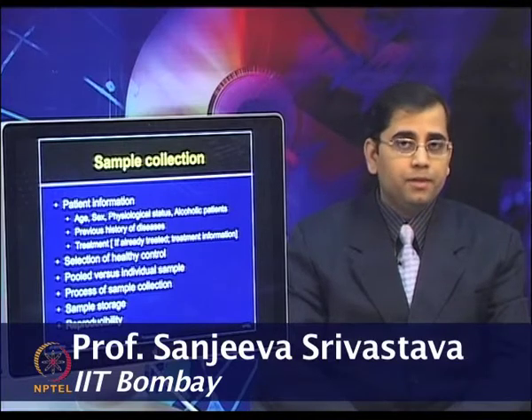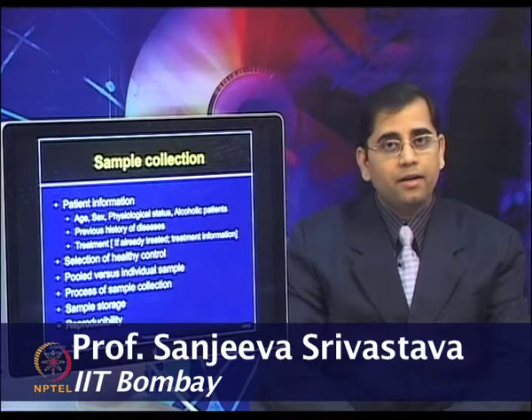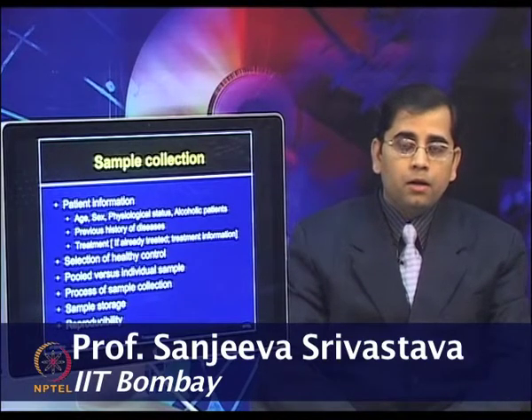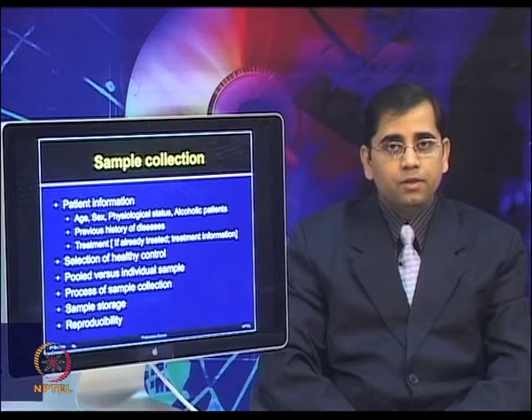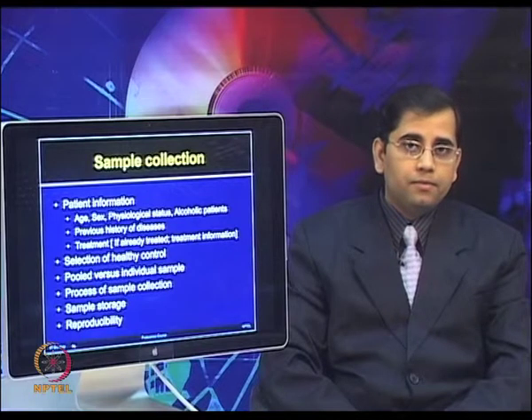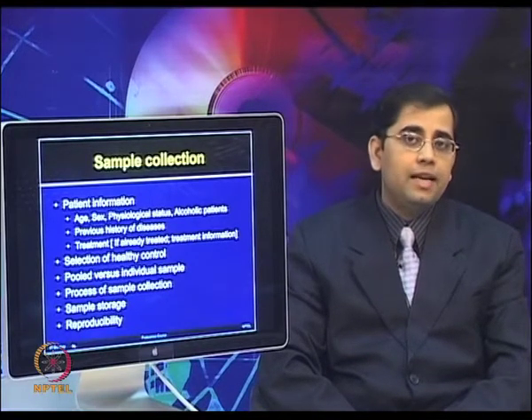Okay, after watching this animation, now you must be clear of the various steps which are required to perform this experiment. In clinical studies, first of all, obtaining the clinical samples and getting the right type of clinical sample is a very challenging question.